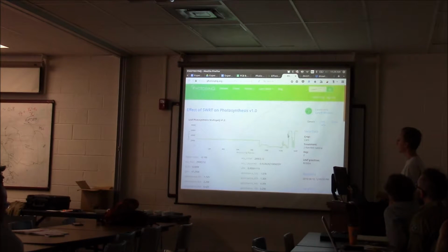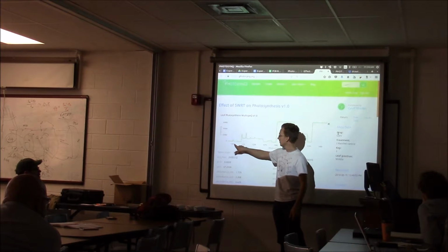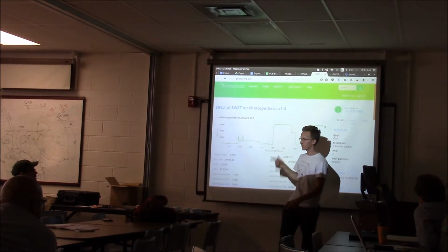So this last part is just a whole bunch of absorbers at different wavelengths. Each of these little things is absorbance for red light, green light, blue light, 940 nanometers, 850 nanometers, and that repeats again and again at different intensities.